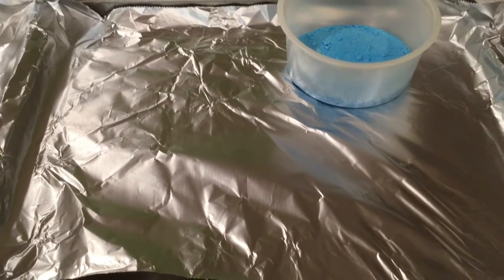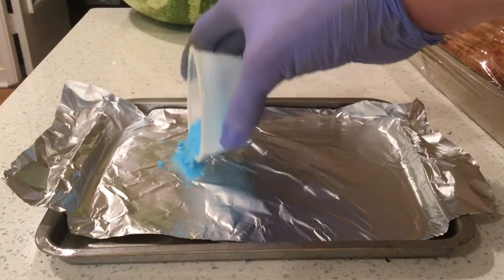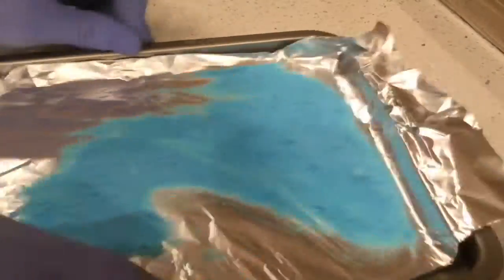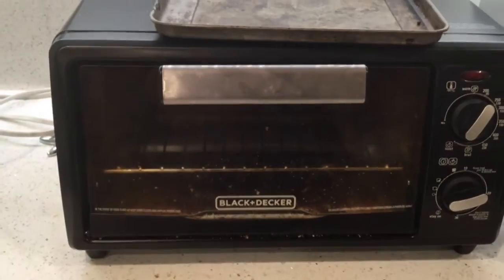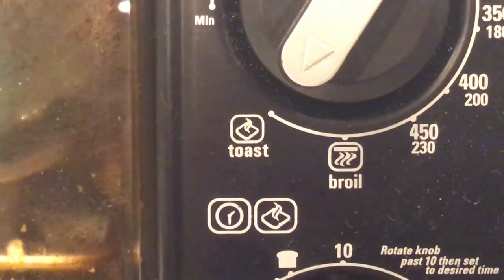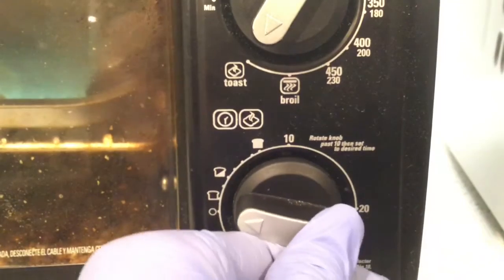So let's spread it out on the aluminum foil — don't worry about the copper sulfate eating into the foil. Now we load it into our Black and Decker lab oven — with crumbs of science on the glass. If you're wondering what temperature to set it at — just kidding — set it to about 150 degrees Celsius for about half an hour.